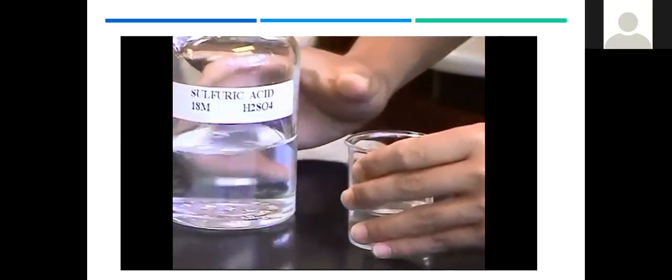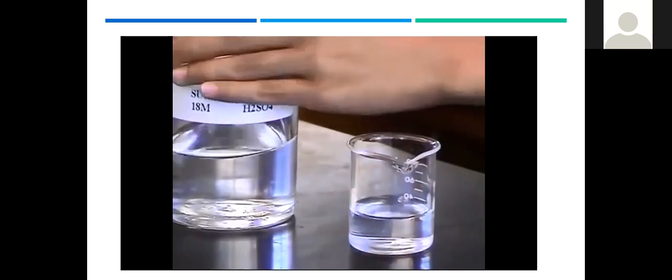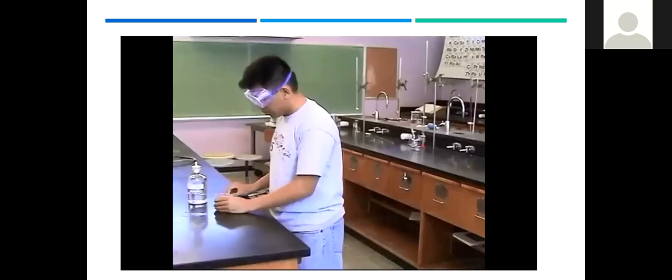Some of the chemicals that you may be using in the lab are very caustic, such as concentrated sulfuric acid. You should never walk around with an open beaker containing a corrosive chemical. This is very dangerous. A moment's inattention or diversion can lead to a truly serious accident. In the event of a spill like this, go to the emergency shower, remove your clothing, and dilute the acid. In a life-threatening situation, safety comes before modesty.